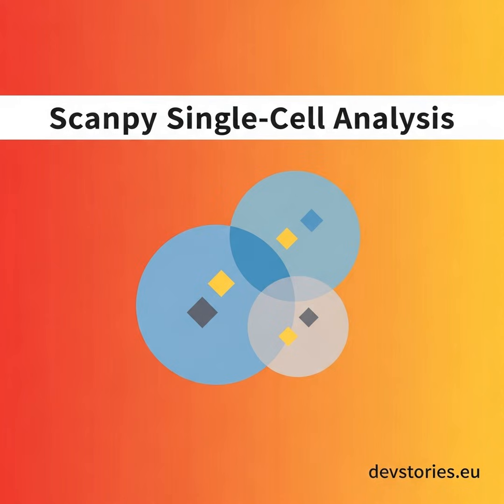The diffmap algorithm treats your manifold as a continuous network. It relies entirely on the nearest neighbor graph of your cells. Once that graph is established, the algorithm simulates a random walk across the connections. Think of it as modeling a diffusion process, similar to how heat spreads through a physical material. The algorithm evaluates how easily a signal can travel through the dense regions of your data. It calculates the probability of moving from one cell state to another over a specific number of steps. Cells that share a high probability of transition are placed closer together in the final lower dimensional space.